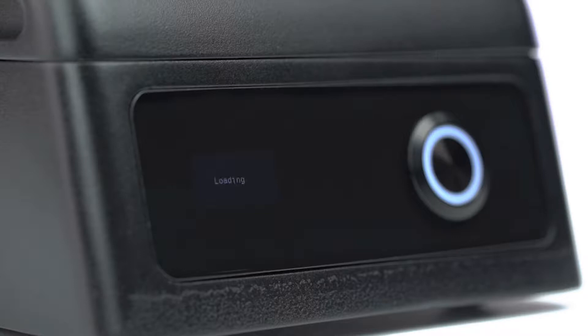When the device switches on, we see the light indicator of the measure button turning on and software loading. The word 'loading' appears on the display.